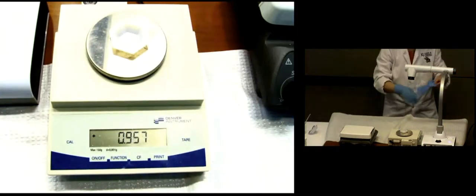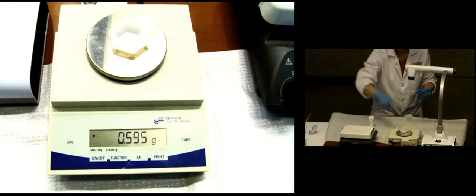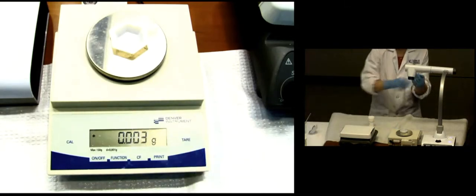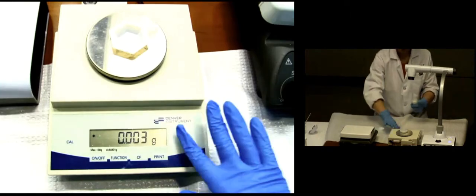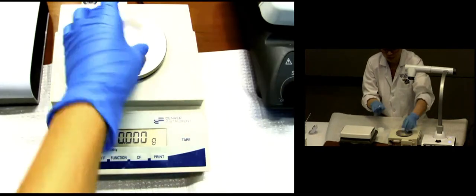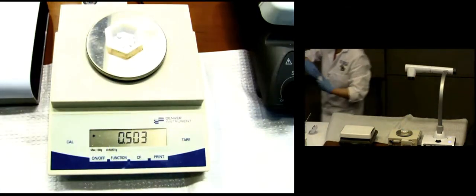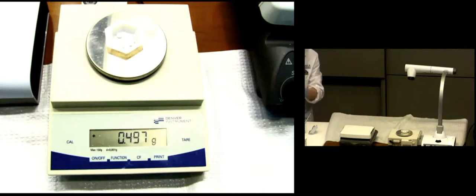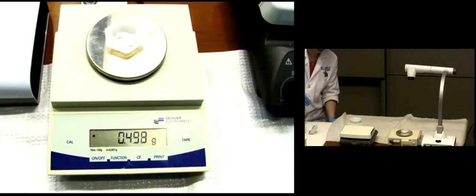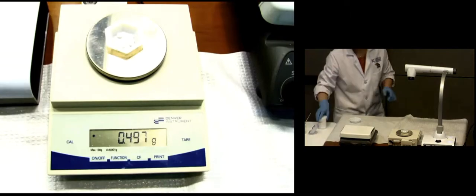Ondansetron is a tablet. Let's measure the tablet first. Does she need to crush up the tablets before she weighs it? No. Good. Now let's write down 0.497. 0.497 grams represents the weight of 5 ondansetron tablets.